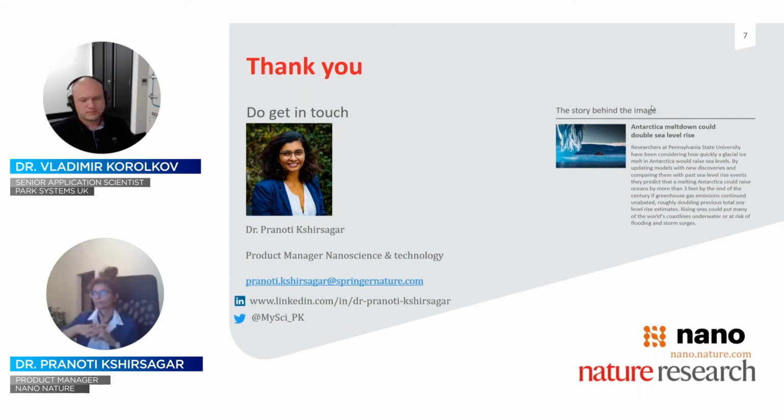Yeah. Super, thank you, Pranoti. Another question for Vladimir here. What is the nano high resolution AFM in contact mode or in tapping mode? From Ali.